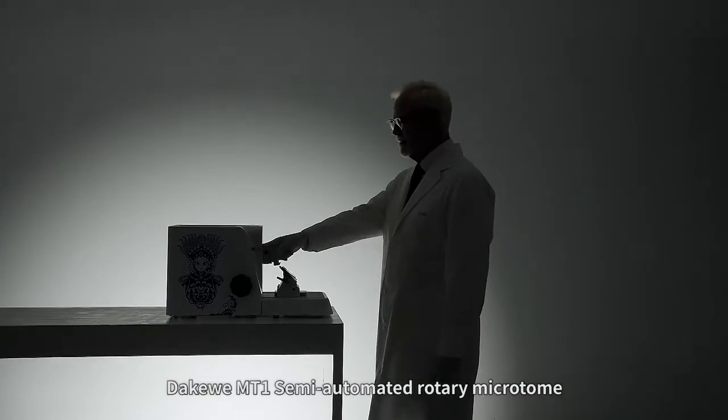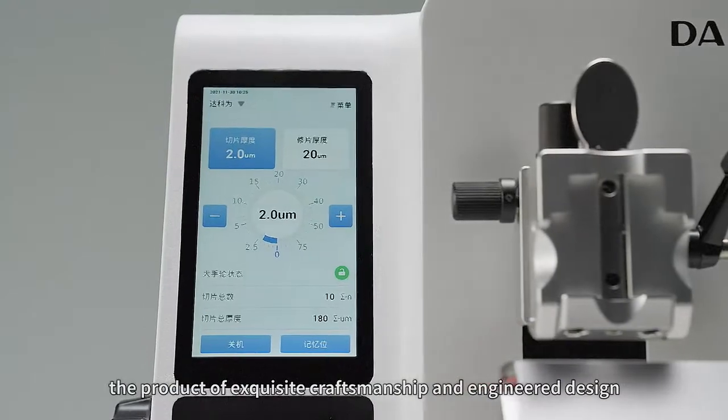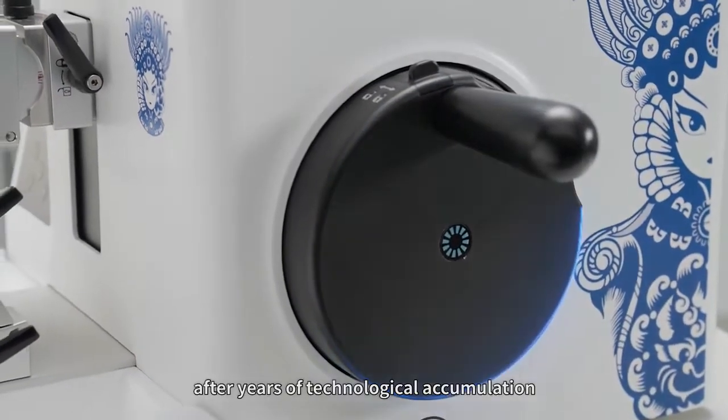Dakewe MT1 Semi-Automated Rotary Microtome — the product of exquisite craftsmanship and engineering, designed after years of technological accumulation.